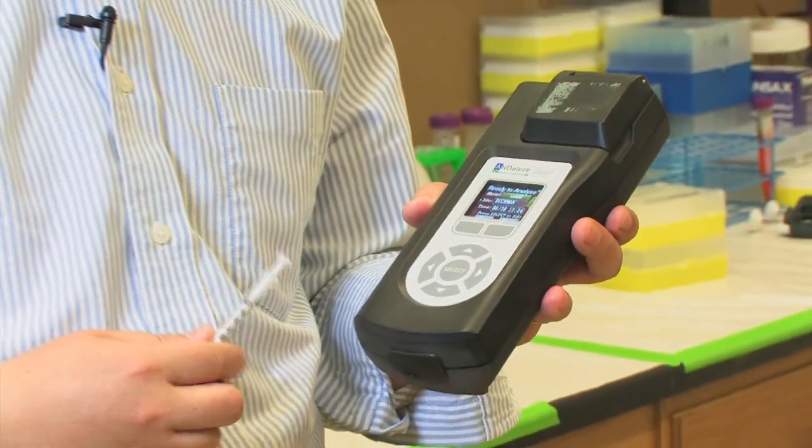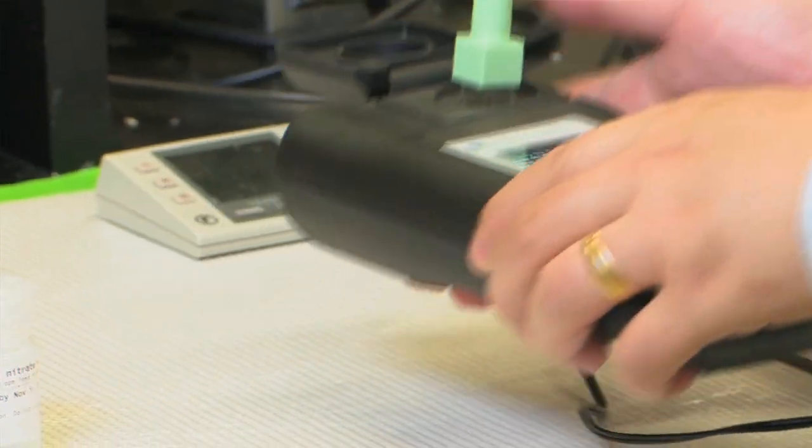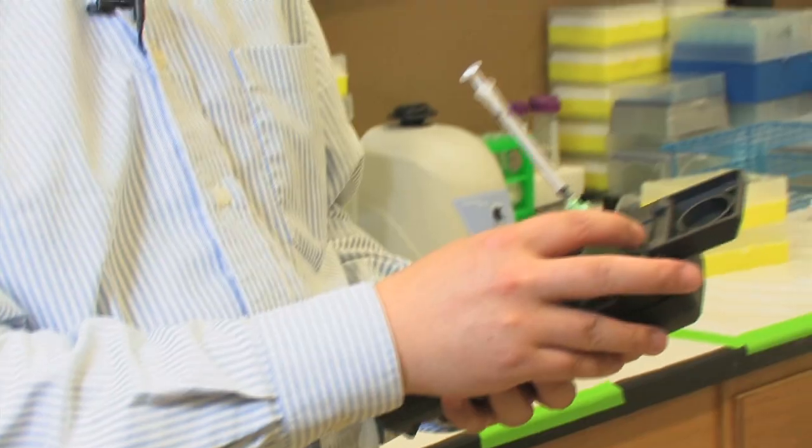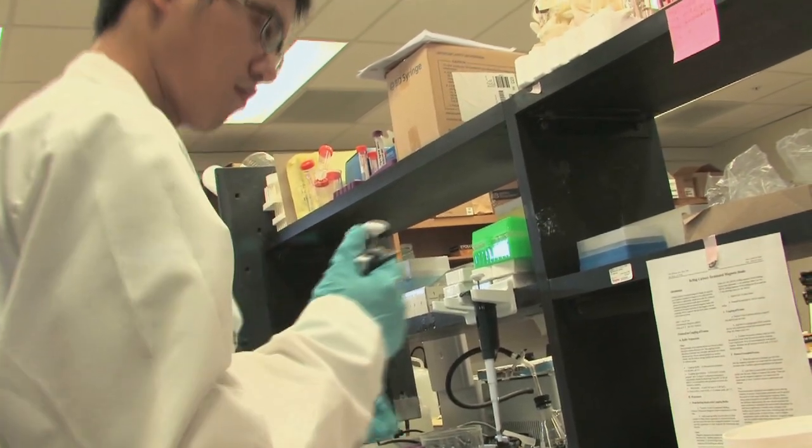The principle behind this meter is based on fluorescence, where the DNA will in the presence of target cleave the DNA, release the fluorophore, and then have increase of fluorescence signals. The same technology can be applied. It's just a simple change of the software. We can develop the same product for detection of organic contaminants, diseases, bacteria, virus, and so on.